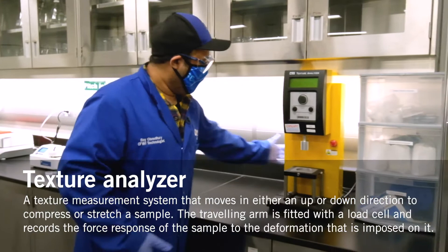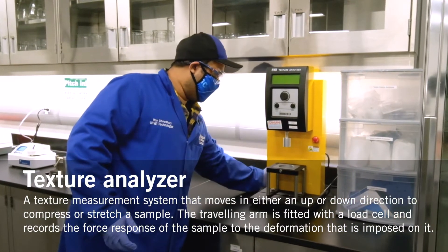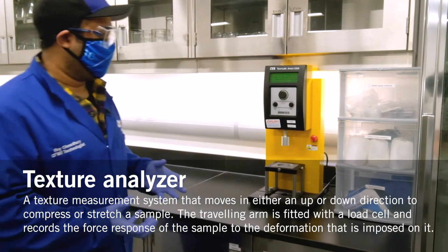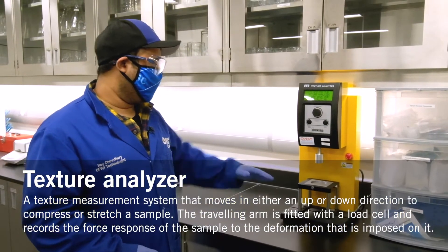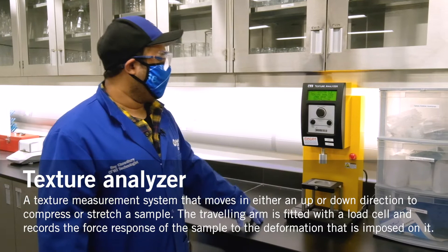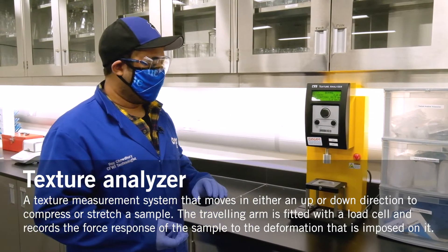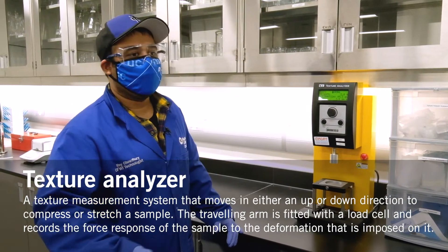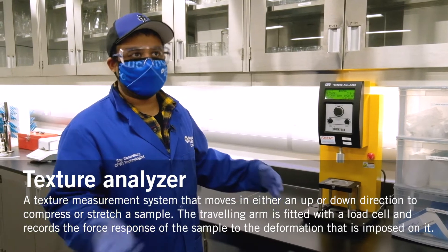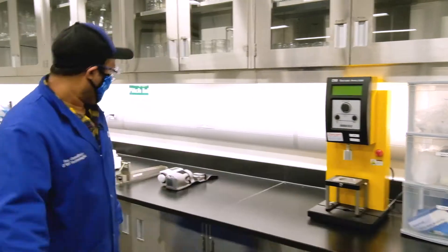This is a texture analyzer. It's mainly used in the food science program. Basically they use this equipment to measure the texture of the food products they're testing — for example, bread. This probe will give a reading of how resistant the product is to pressure as well as the maximum pressure it can sustain. For example, a cookie will obviously have a higher pressure threshold as opposed to bread.